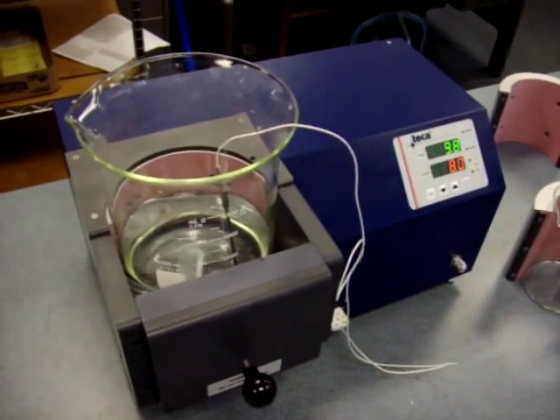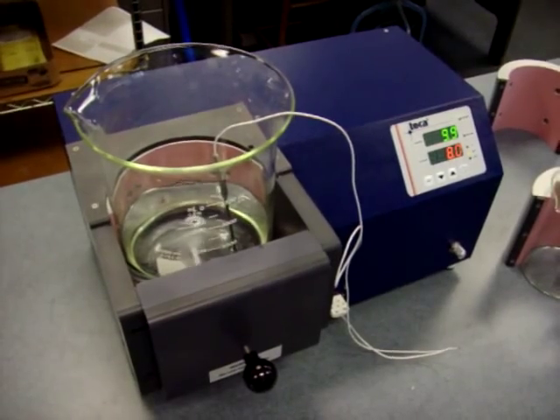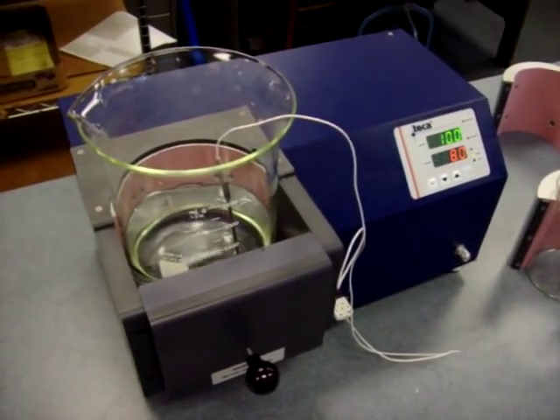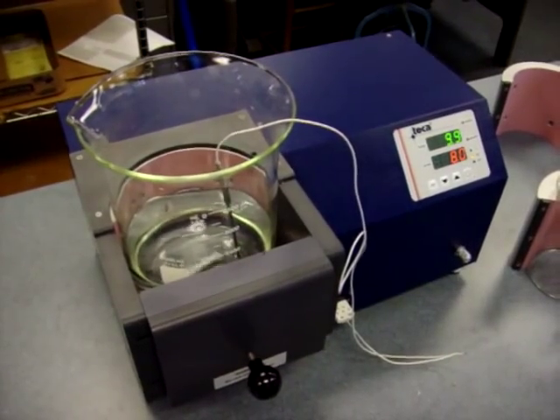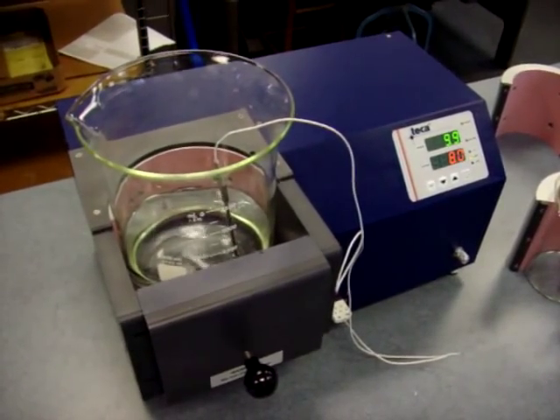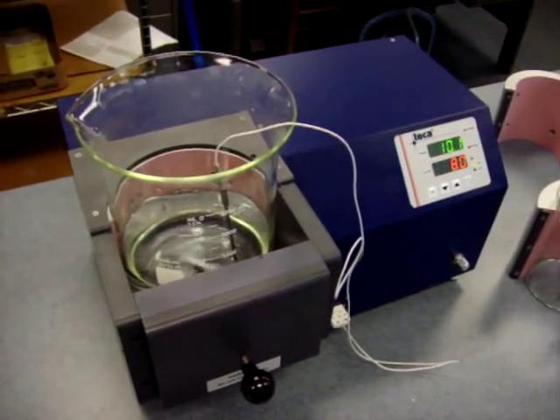Now you mentioned fan speed control. Is that something that the user can adjust themselves? Right now this is adjusted to 50% fan speed, so when the requirement was high you could hear it. It does get a little noisy when you first turn it on. As it approaches the set point it gets much quieter.